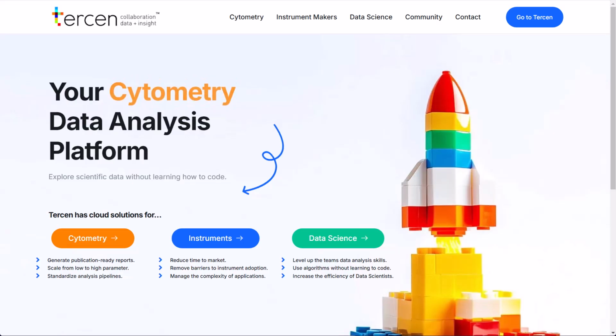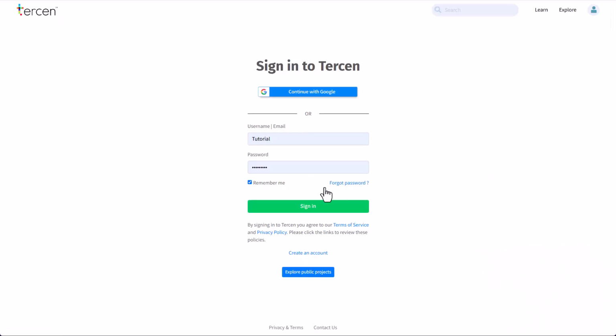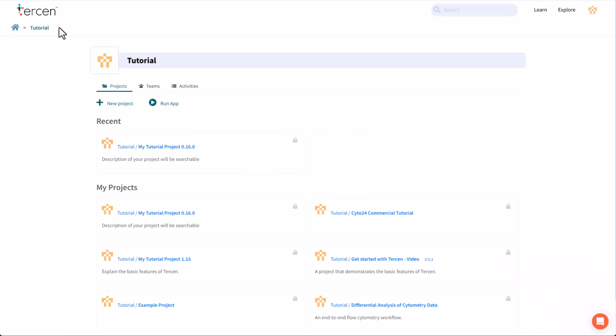Hi, welcome to Tercen. In this video, we'll explore some basic features and get started with data analysis. First thing, let's get oriented. After signing up for Tercen, you will land on your home screen.